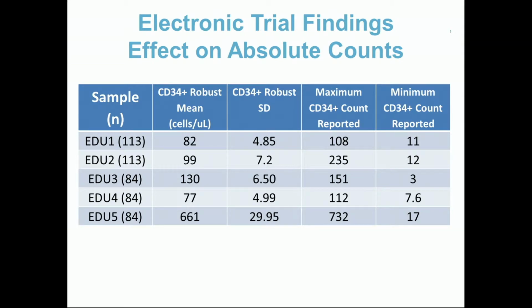So we know that this is all analytical error. This is not a pipetting problem. This is not somebody using the wrong fluorochrome or the wrong clone. This is not a sample fixation issue, because these were fresh samples that we acquired. This is just drawing of a gate, and we've got problems.